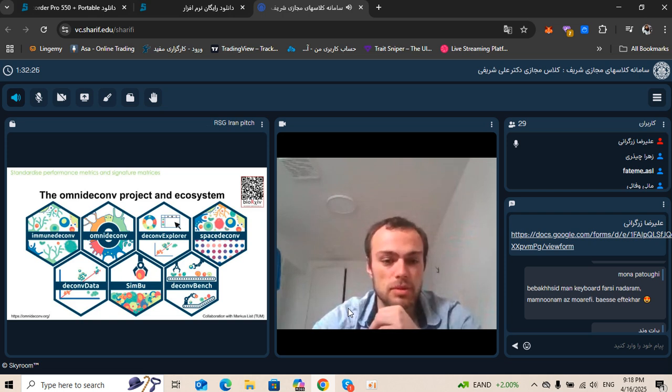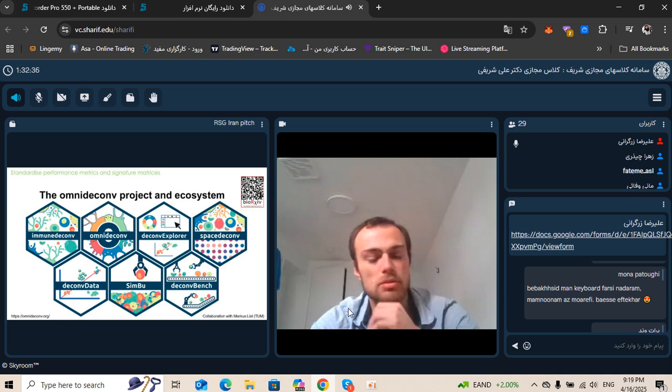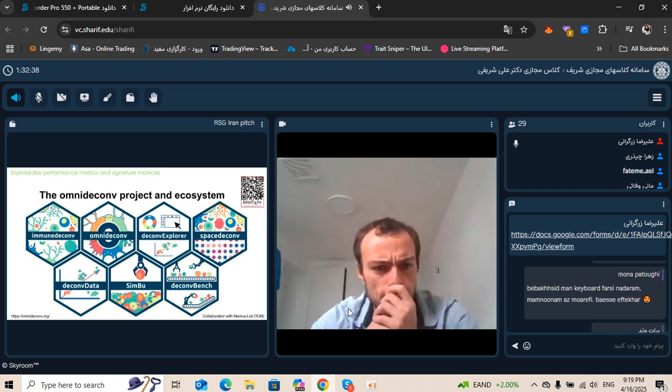For mass spectrometry, I'm not a biologist by background, so I may miss the point here. So, what's the general purpose of mass spectrometry? Let me see if they want to. Mizak, do you want to open your mic and ask your question yourself? To quantify the proteomics profile.